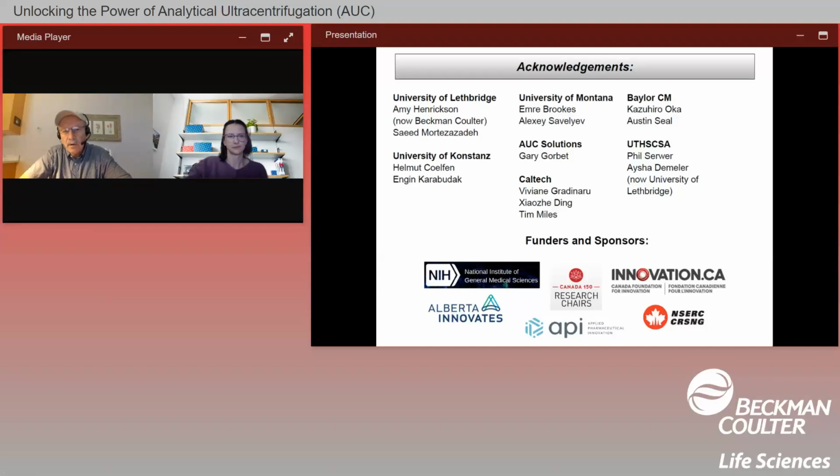So probably 10 to the minus 3 per second, 10 to the minus 2 is probably the upper limit of what you'll ever see. So it's on the order of minutes and hours that you can measure in an AUC experiment for the K-off rate. So kinetics, not so much, but equilibrium constants for sure. That is a bread and butter application for AUC, to measure KDs.